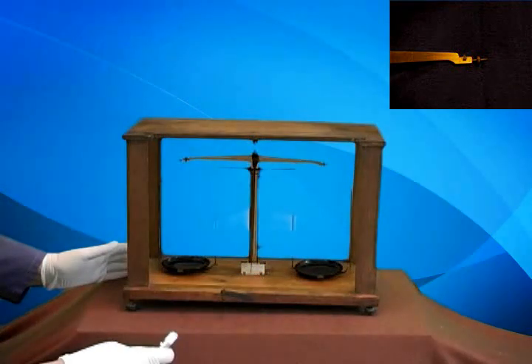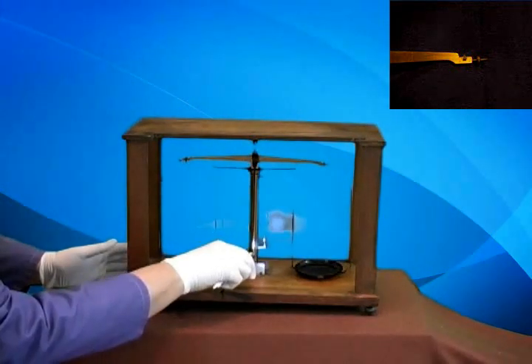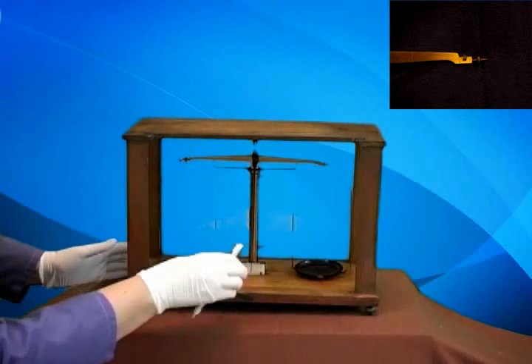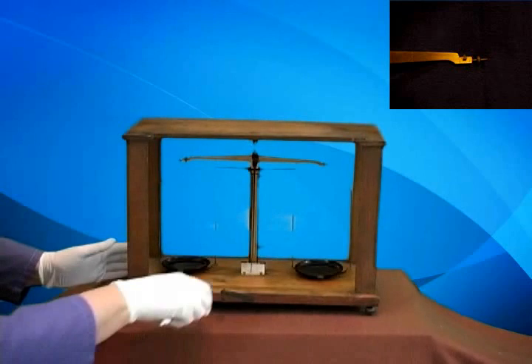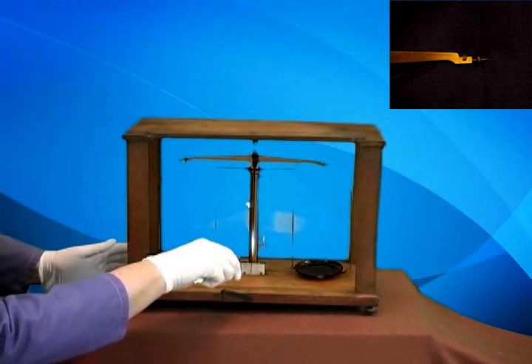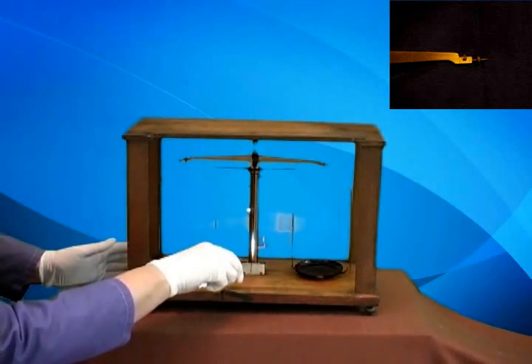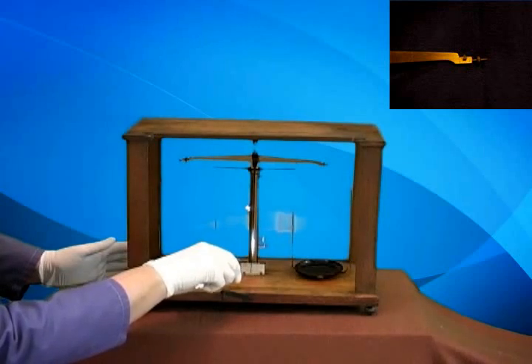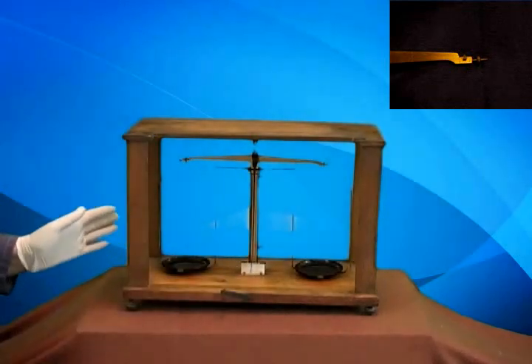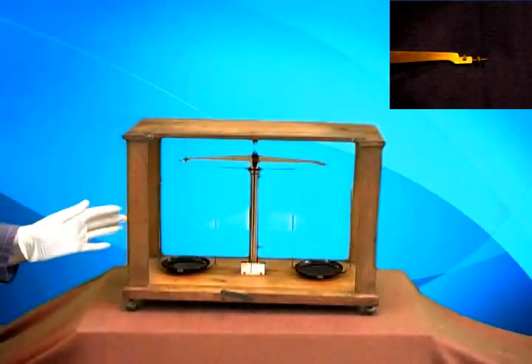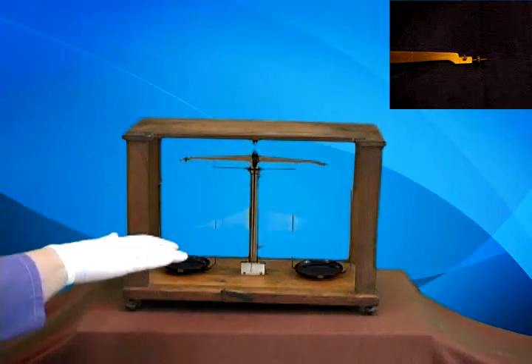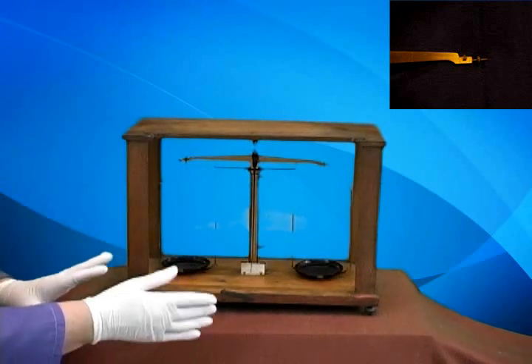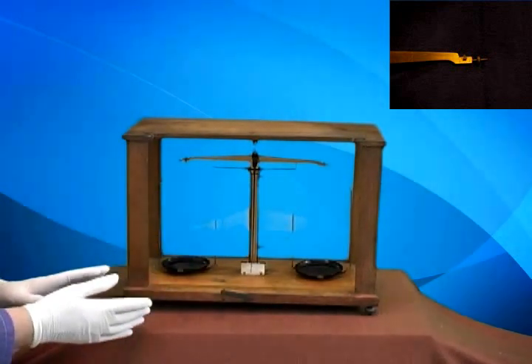Now, I don't know if you can see the plumb bob or not, but it's right here. It is that swinging piece right there. That's your plumb bob. Do you see it swinging there? And it needed to line up exactly with the point right below it. And when it did, they knew the balance was level. In order to get the balance level, they would adjust the screws on the legs to raise and lower each side or both to raise and lower the front.